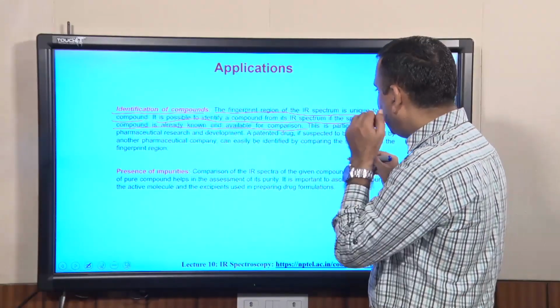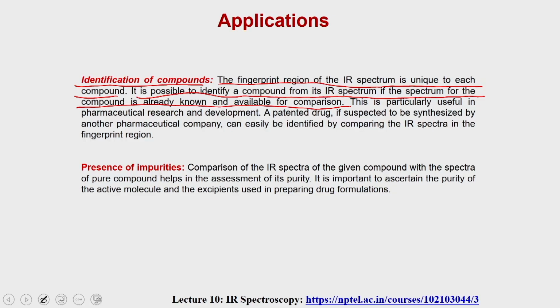So, it is very important that you have a standard IR spectrum for comparison if you would like to use IR spectroscopy to identify the compound.